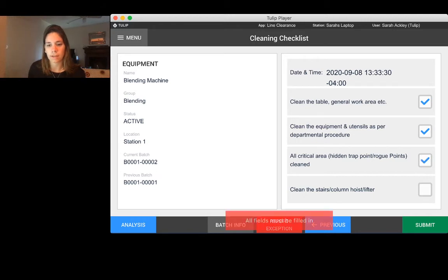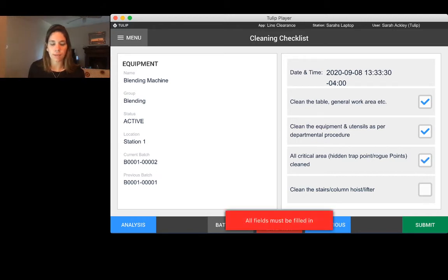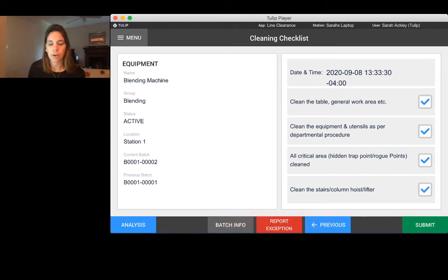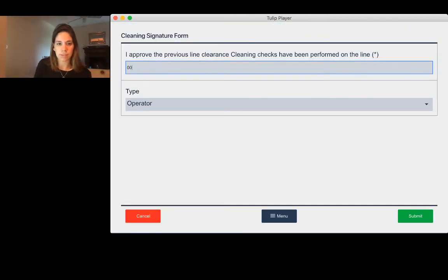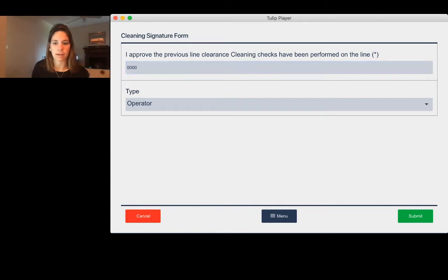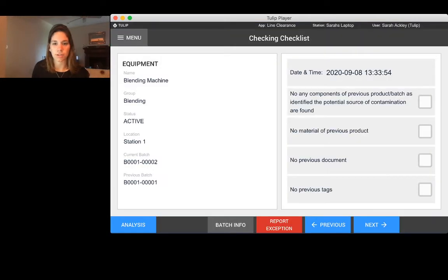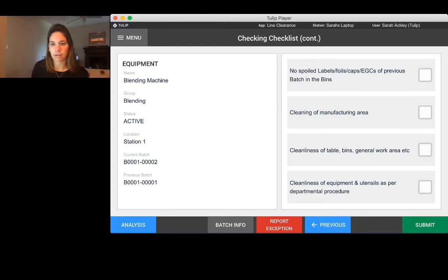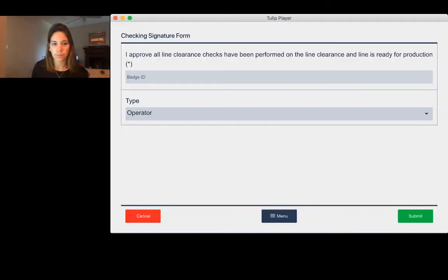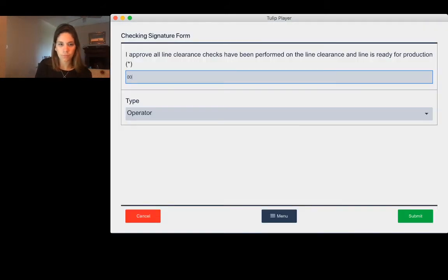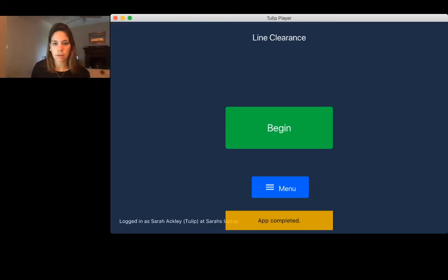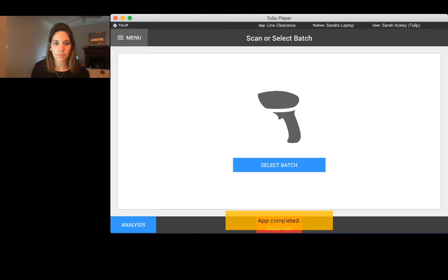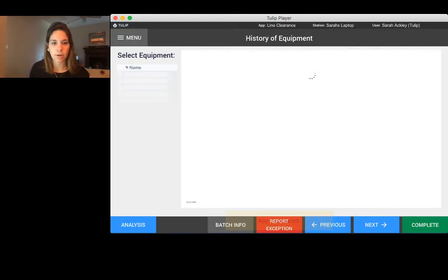One other thing that TULIP does do is you can make sure all of your fields are required. That's just building quality into the design of the application. We go through and confirm our checking, and now we've completed the line clearance for that new batch.